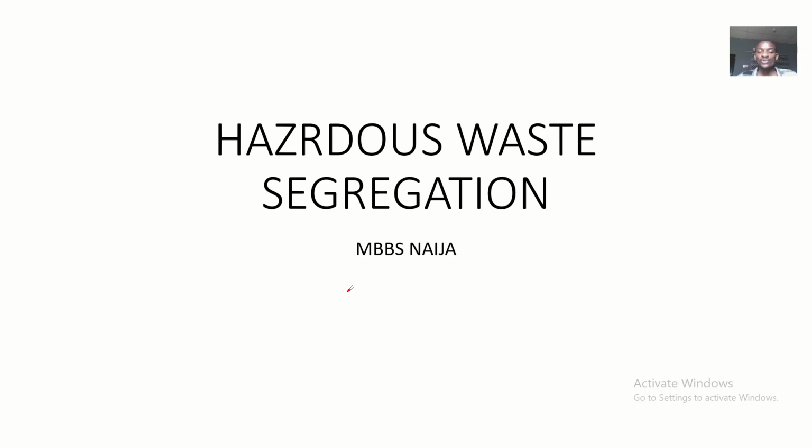So quickly, guys, you'll be looking at hazardous waste segregation. Hazardous waste segregation is basically a part of laboratory safety. You are having waste in the laboratory, all of it waste, do you understand? But not all waste is of the same type.